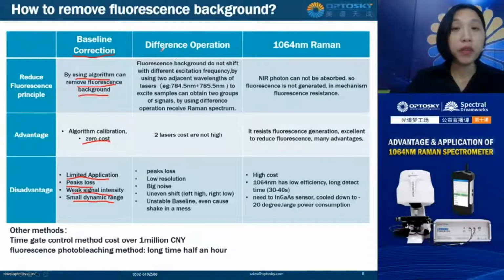However, we also know the difference operation is very good to use because, in principle, the fluorescence background does not shift with different excitation frequency.